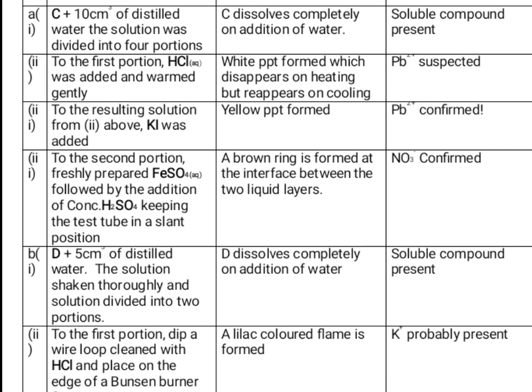So here is a template that will serve as a guide, and it contains the likely questions to expect in this forthcoming practical examination. The first test will be to add 10 cm cube of distilled water to sample C, and you'll be asked to stir vigorously.